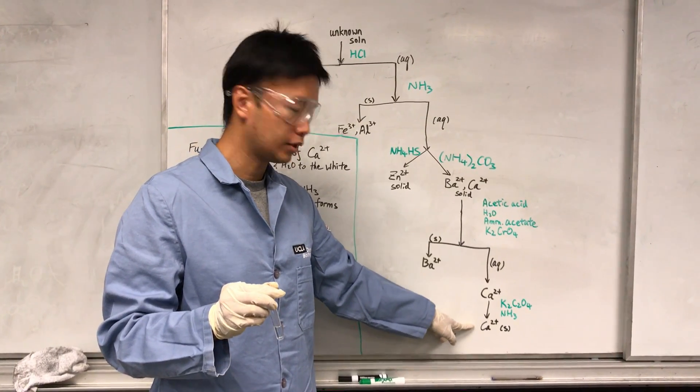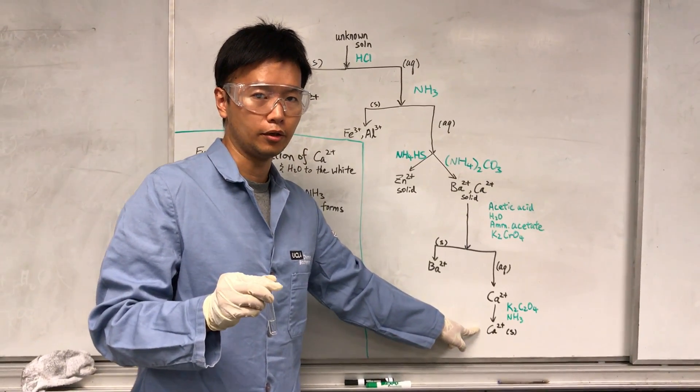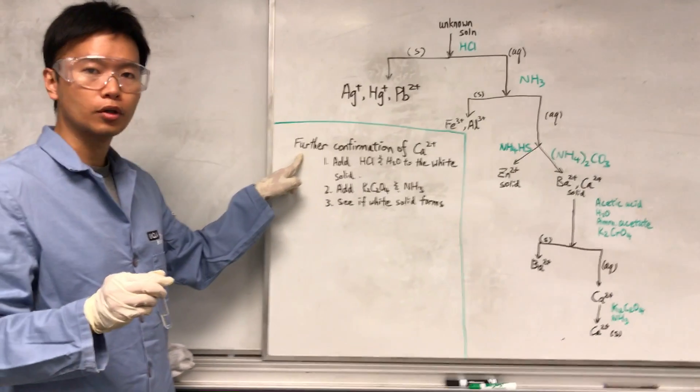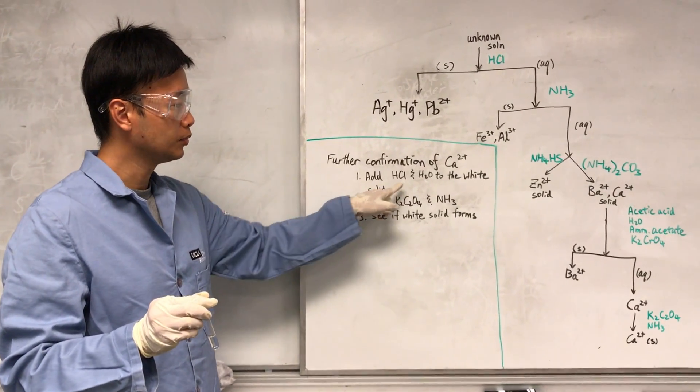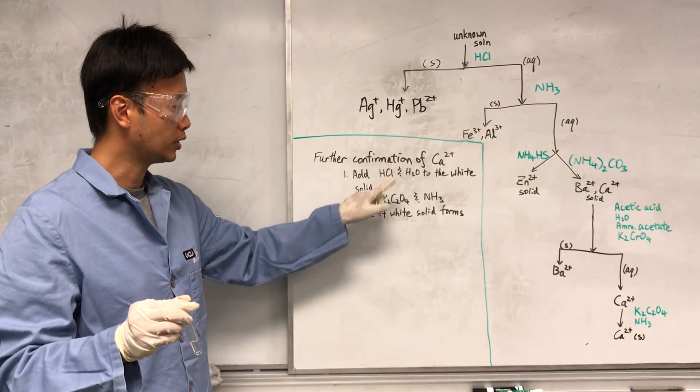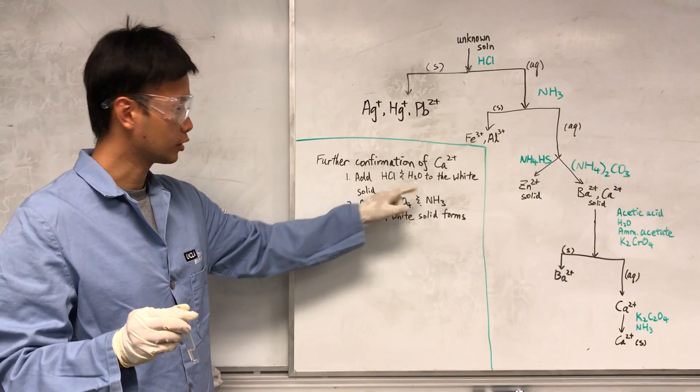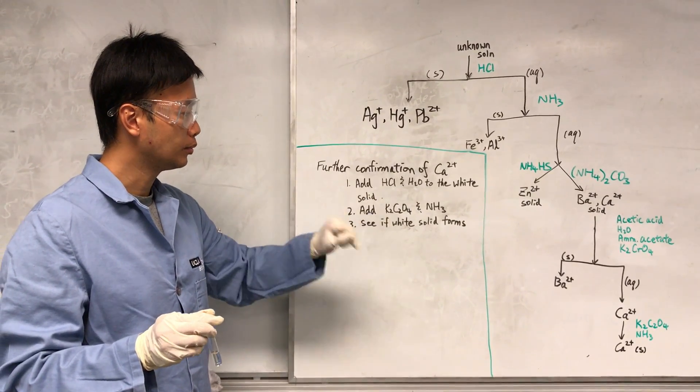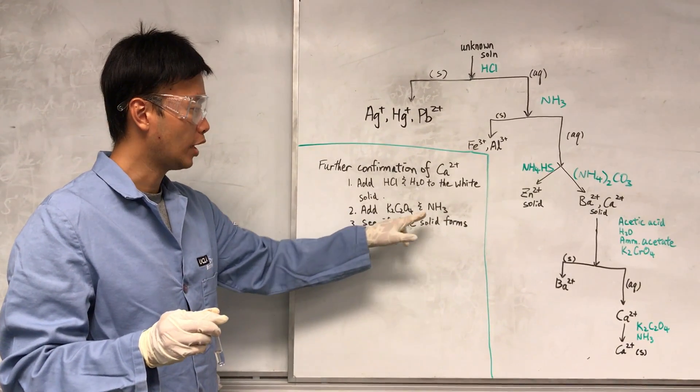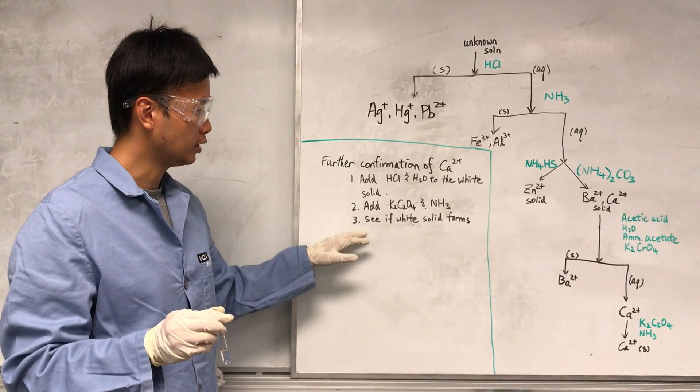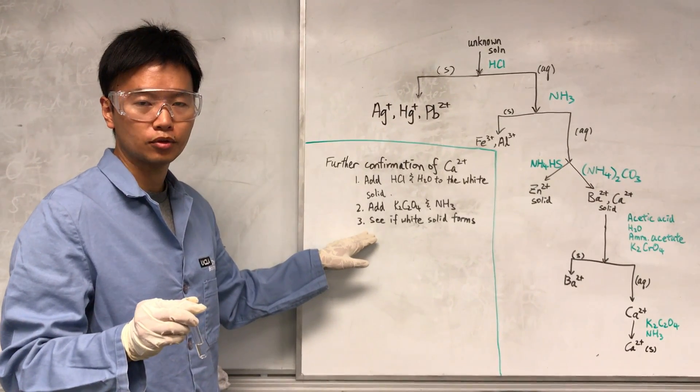Hopefully I will get a white solid. And the other portion I have to further confirm the calcium by dissolving the white precipitate by adding acidic water, then re-adding K2C2O4 and NH3, which is basic, and eventually see if I have white solid form.